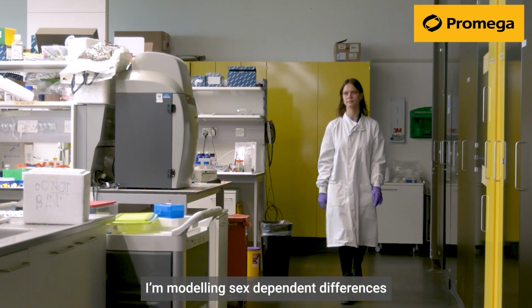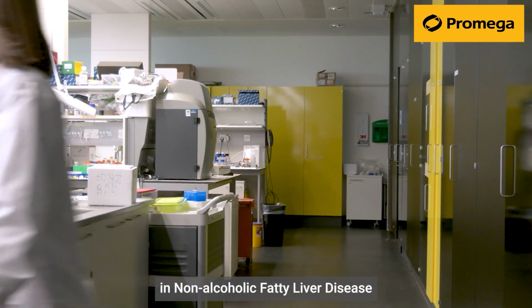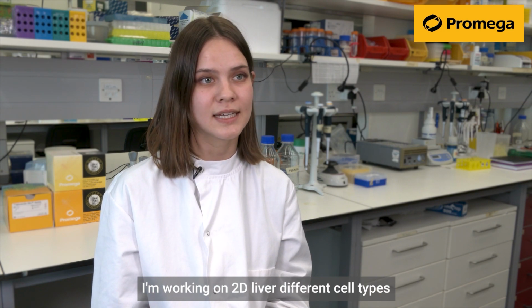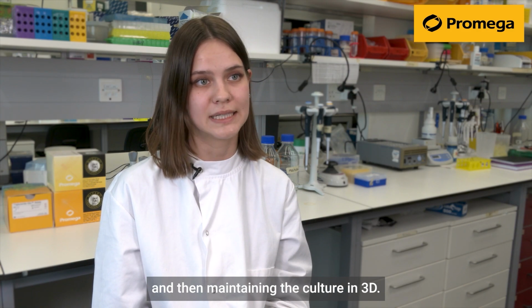I am Alvile Kasarinaite, the PhD student under the Precision Medicine MRC grant, and I'm working with Professor David Hay in the Centre for Regenerative Medicine. I'm modeling sex-dependent differences in non-alcoholic fatty liver disease using stem cell-derived liver tissue. And I'm working on 2D liver different cell types and then maintaining the culture in 3D.